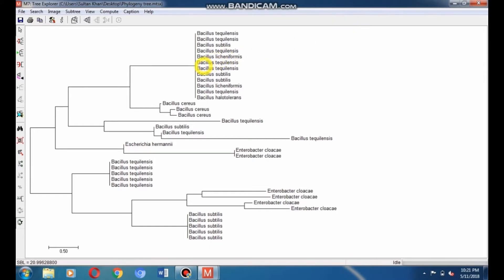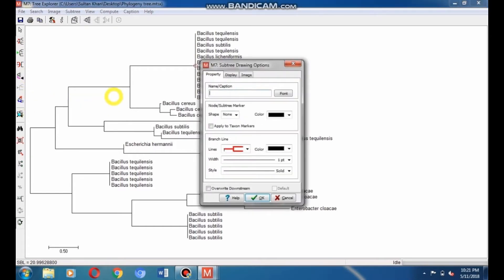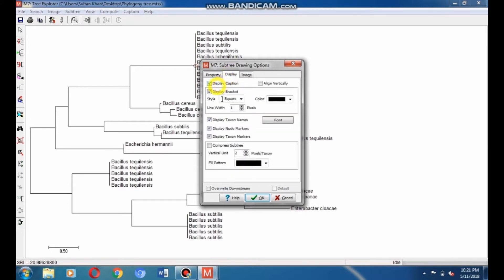Go to the first clade of the tree and select the node of the clade. Now go to the left side tools where you will find the subtree drawing option. Use it to make your phylogeny tree colorful. Select the subtree option, click on Display, go to Display Caption and Bracket option, and hide the caption and bracket.